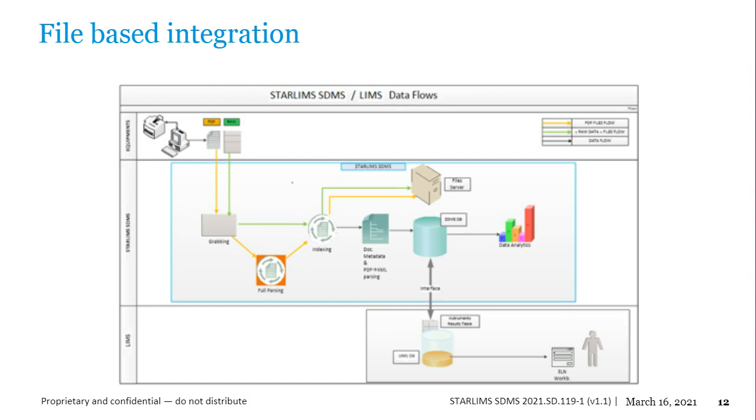And there are two different parts of this. There's the file recognition pattern, which includes the metadata and the file types. It could have pushing to a workflow. And when you upload similar documents, in the case of instruments of the same type, the system would be able to find those meta tags in its database, and it will recognize the relevant file type and the workflow. And then we have a second type, the document recognition pattern.